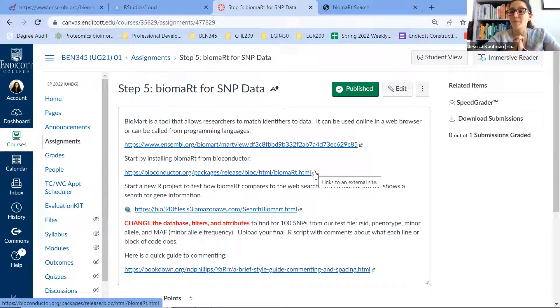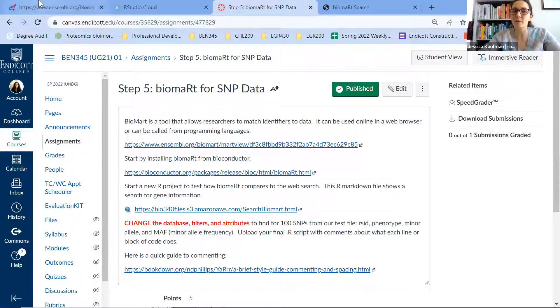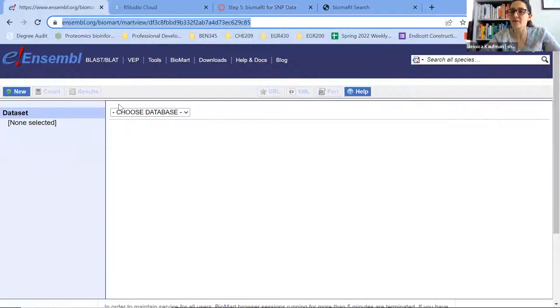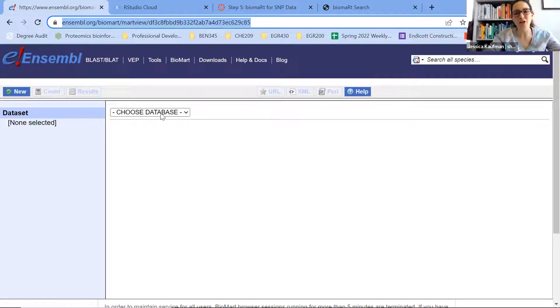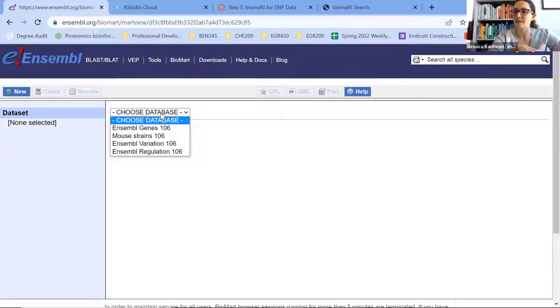In this video I'm going to show you how to do a Biomart search in R. This is what you're doing for step five of the project, and it's really similar to what you just did in step four where we used the website version of Biomart. On the website, every time you want to make a decision about which database or dataset you're using, you select it from a pulldown menu. The script is the same thing except instead of a graphical interface, you have to type each command.